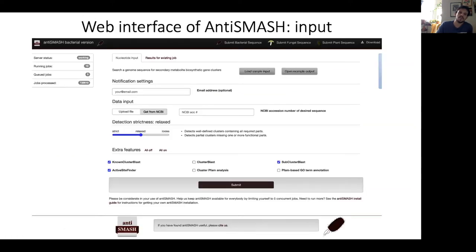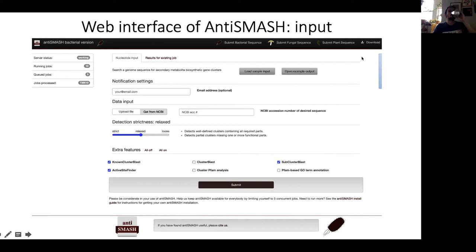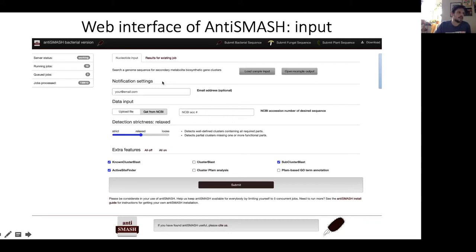The web interface of antiSMASH looks like this. If you Google antiSMASH and click on the first result, you'll get a page like this. You can submit bacterial sequences, fungal sequences, or plant sequences. Clicking the Download tab gives you installation instructions and a brief tutorial for the standalone version. You can also download the entire package, which allows you to inspect the HMM library manually if you're interested in doing so.